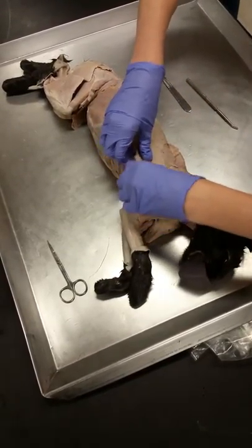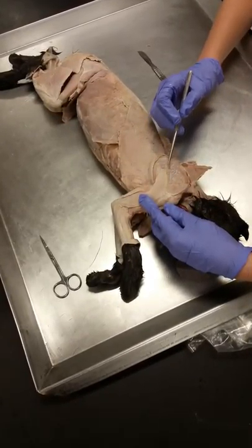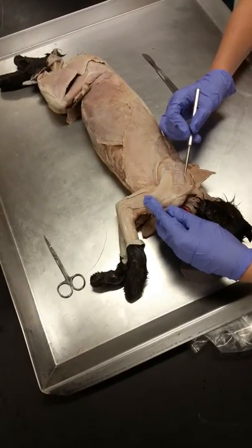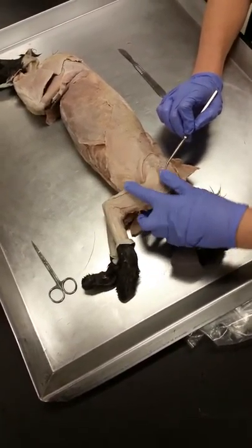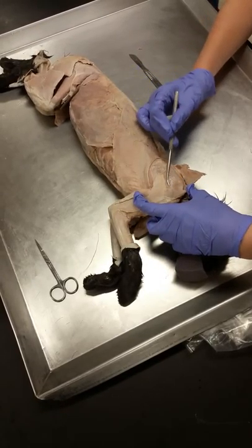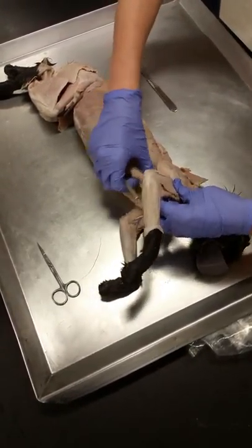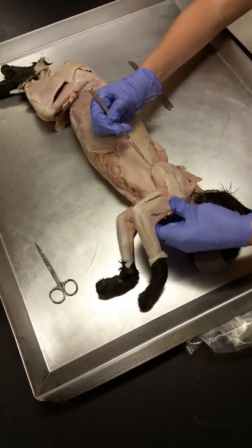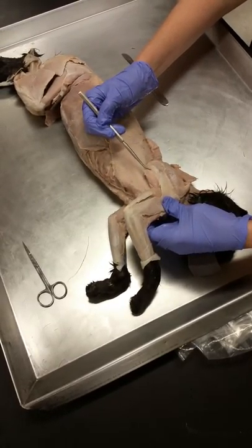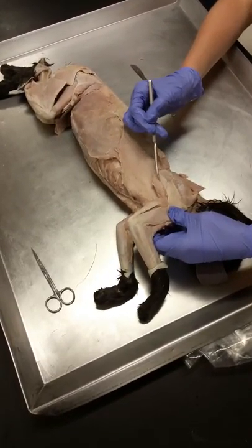Once we've got latissimus free, we can see the muscles on the scapula. Here's the spine of the scapula — the fossa above the spine is the supraspinous fossa, so this muscle is supraspinatus. The fossa below the spine is the infraspinous fossa, so this is infraspinatus. Then this little muscle down here is teres major. Cats don't have a teres minor that we can find, but we will find teres minor on a human — so for now, cats only have teres major.